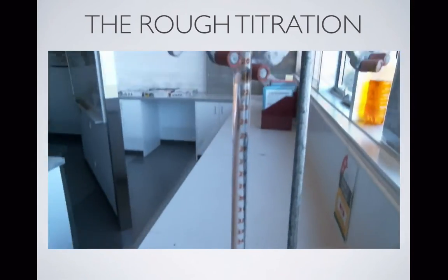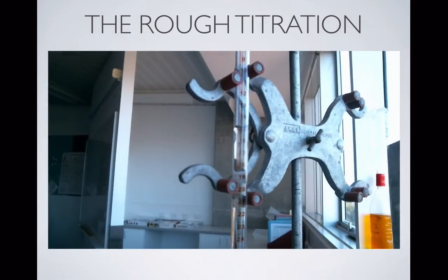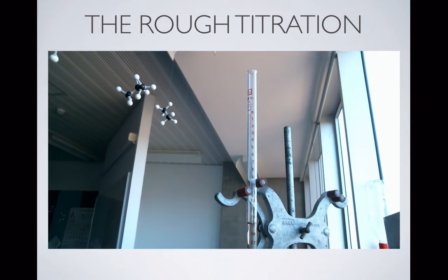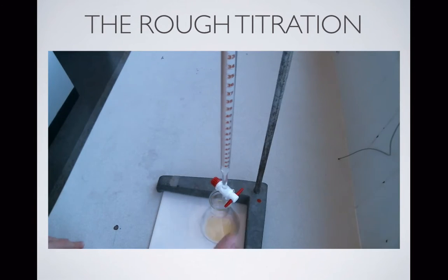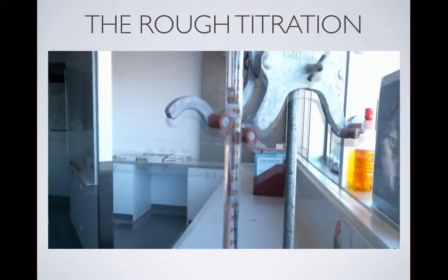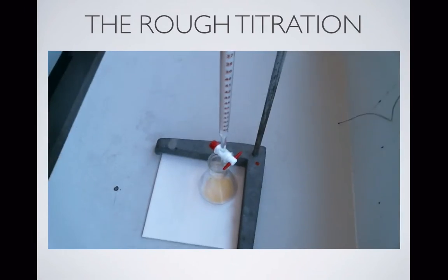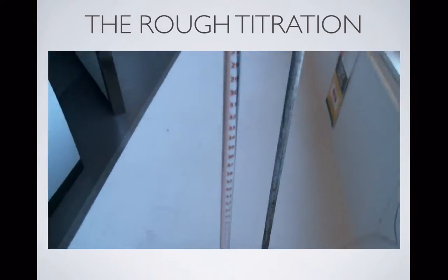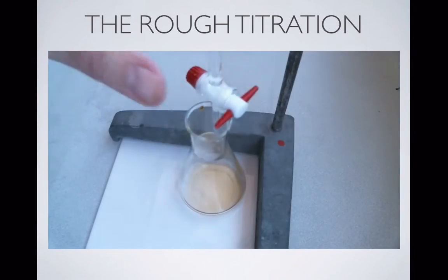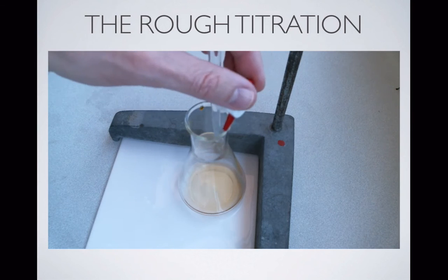Now we obviously want to check what our initial reading is, and we also want to make sure that our funnel isn't in the top of the burette. So now we're going to start adding the liquid about a mil or two at a time. We're not trying to be very accurate. We're not trying to hit the end point exactly. We're just trying to get a rough idea of how much liquid is needed to get the reaction finished.